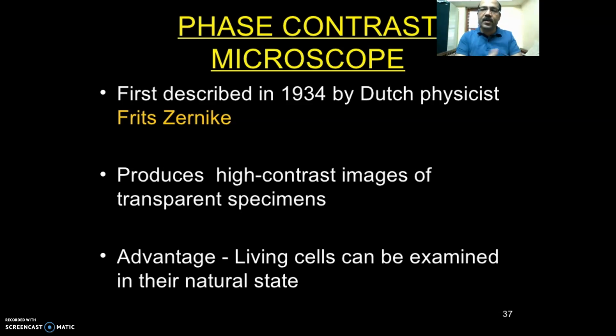The specimen should be transparent, and without using any stain, this instrument gives us a good image based on transparency. The most important advantage of this microscope is that living cells can be examined in their natural state.